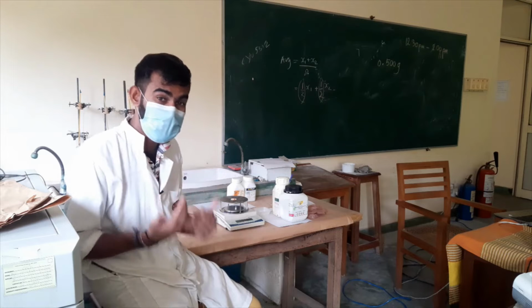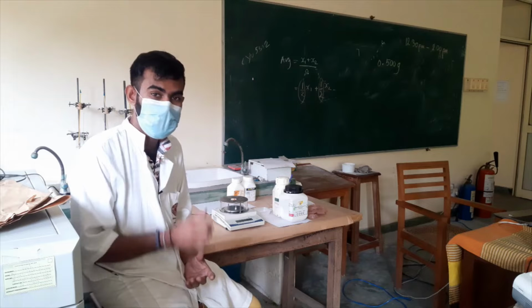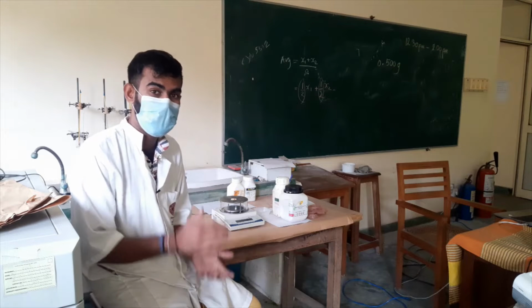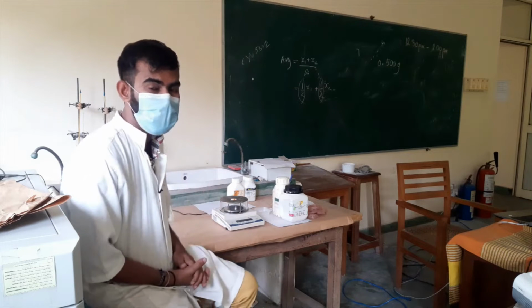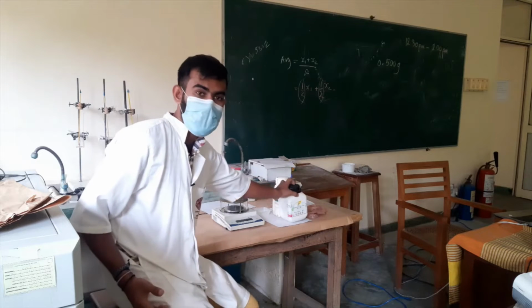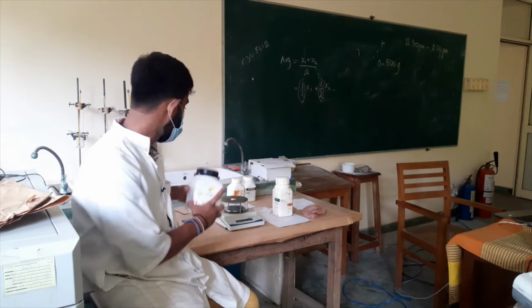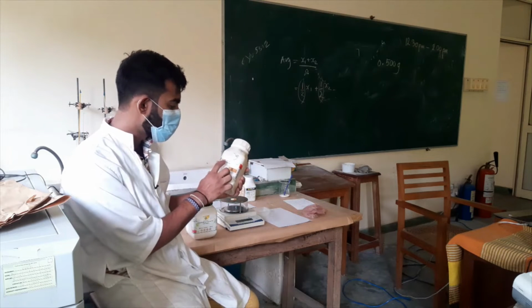However, to prepare this stationary phase, we have to prepare TLC glass plates. We coat our silica gel as the stationary phase on these glass plates. Before doing that, we have to prepare this silica gel composition. Here you can see there are two types of silica gel. This is silica gel GF254, and here we have another silica gel type, silica gel G60.